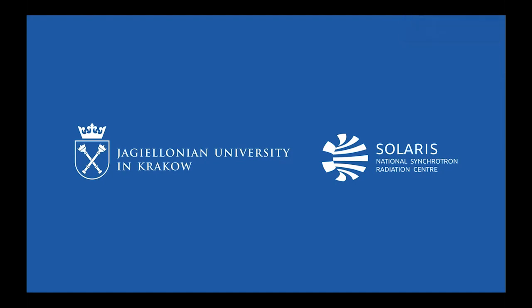So IGOR Pro is probably one of the most popular software designed for and used to work with multidimensional sets of data, and for sure it is the most important and most commonly used software in every ARPES group all around the world.